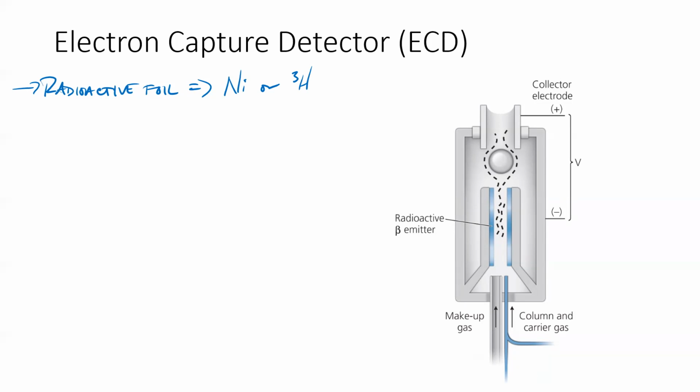So I know you've heard about deuterium. We talk about deuterium in organic and things. Tritium is the isotope of hydrogen with 2 neutrons for a mass number of 3. Super radioactive. Doesn't exist very much. And so you end up with a beta emitter. What's a beta particle?